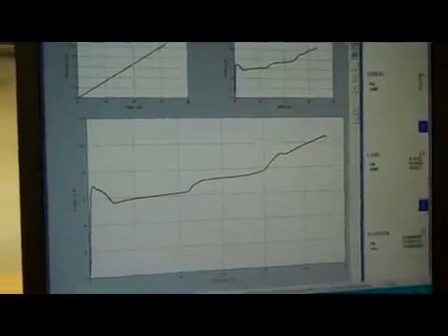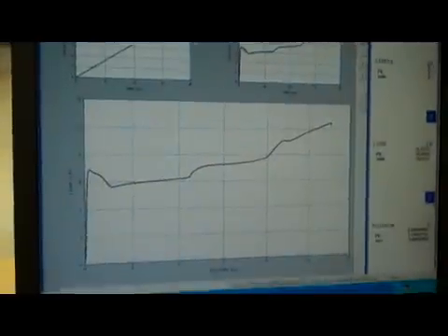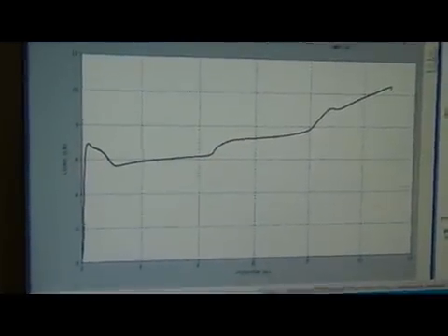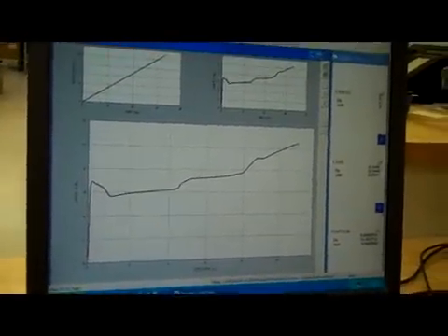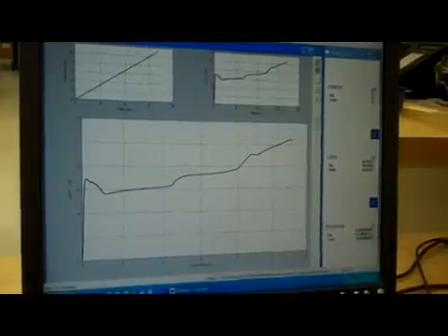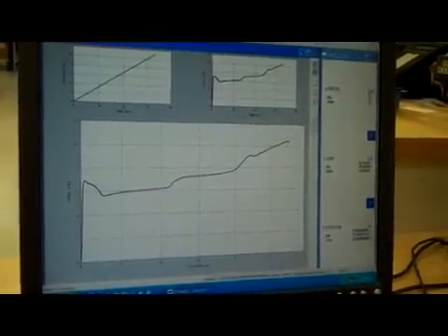Here are the results of the test. This linear region here is the elastic region. That's where we calculate the modulus of elasticity, which is the slope. Here at the end, you can see our force at break and our elongation, which is down on the bottom.